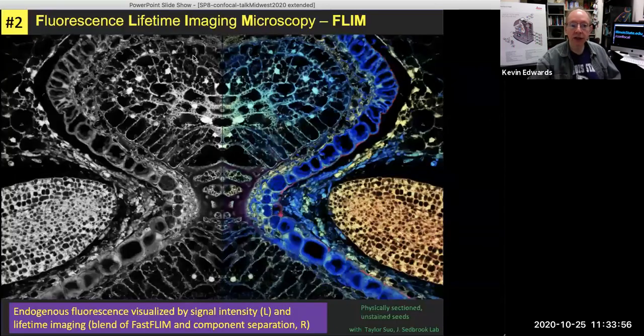All right, so here's what that does for us. If we collect our spectral information very widely, so we're just collecting all the emissions that come out, we're basically going to collect a monochrome image. We're taking all the spectral data, basically throwing it away, just saying, okay, how many photons do we have per pixel, regardless of their wavelength. That's this side of this image.